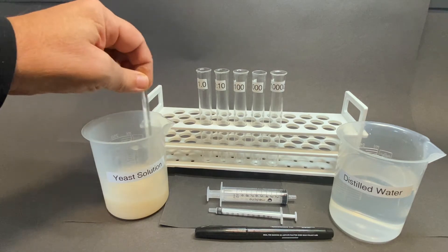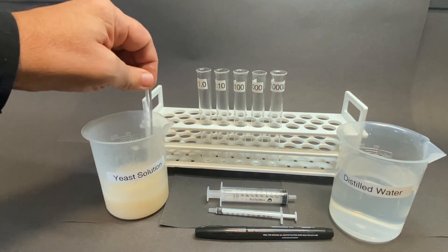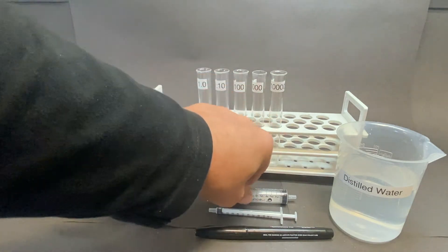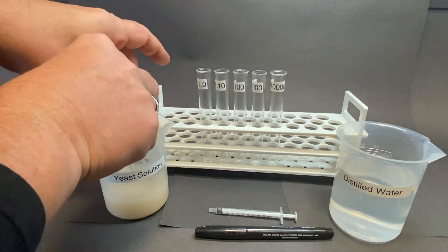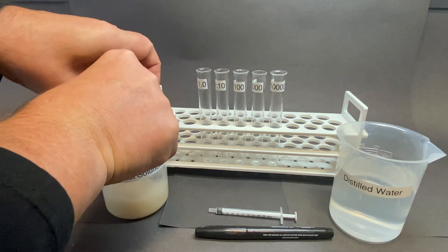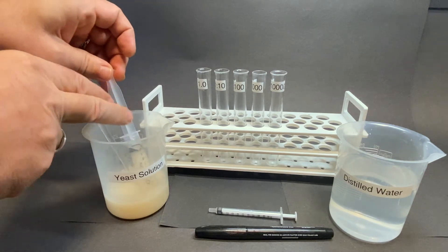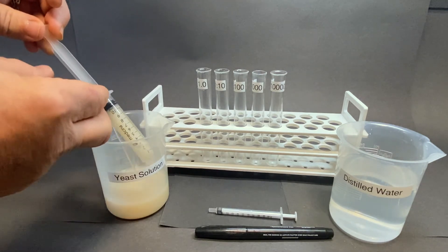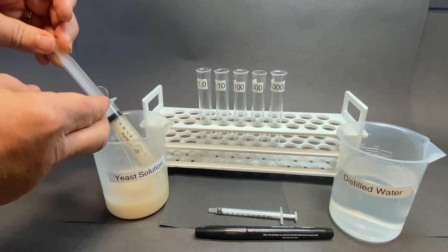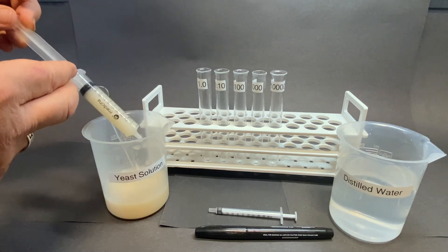For the purposes of clarity in the video, printed labels have been used. Before drawing up an initial sample from the yeast solution, ensure that it is stirred to ensure an even distribution of the yeast particles throughout the suspension. Draw up 10 milliliters of the fluid, ensuring that the bottom of the plunger is at the 10-milliliter marker on the syringe. Deposit this sample into the test tube marked one.